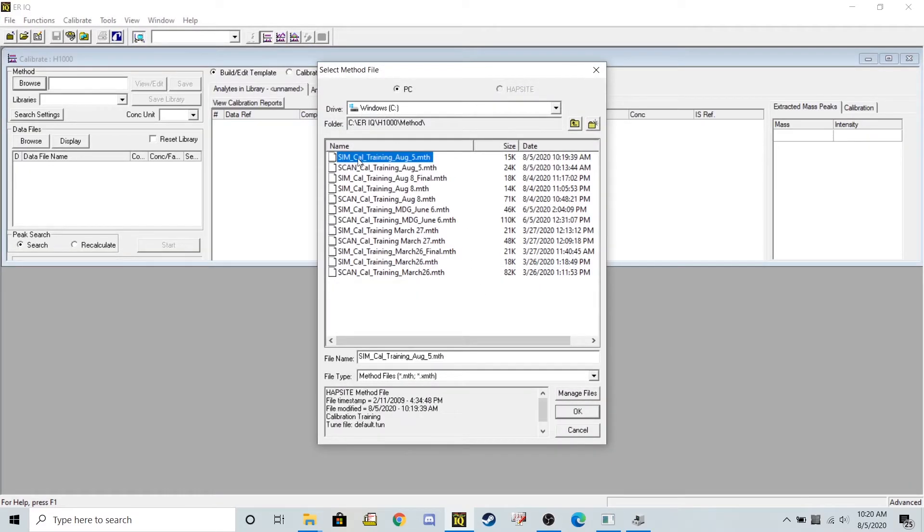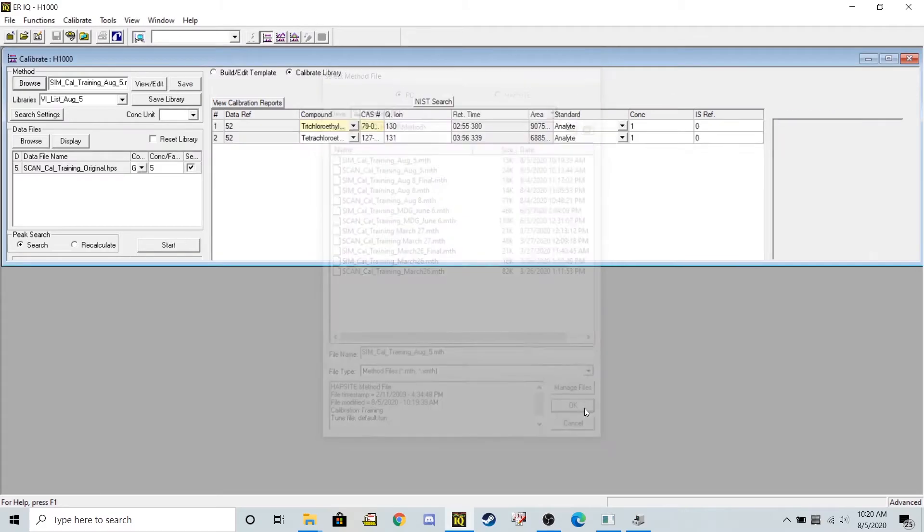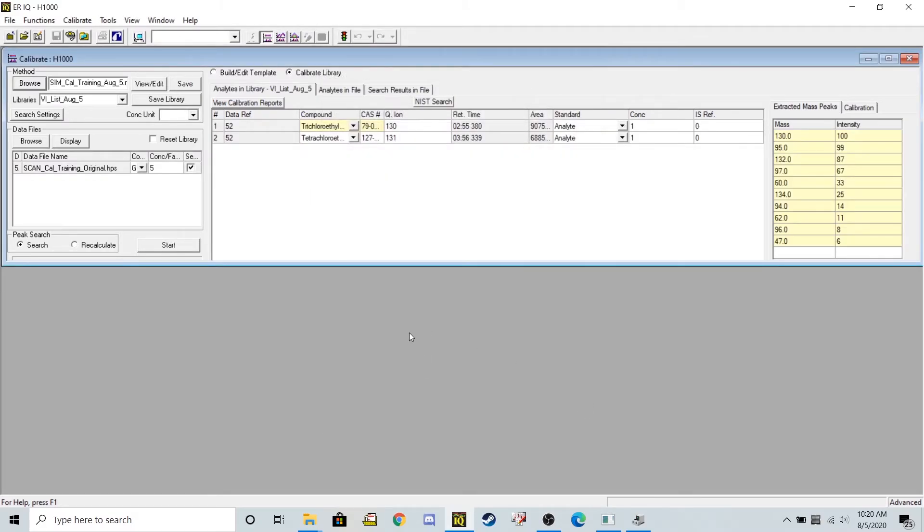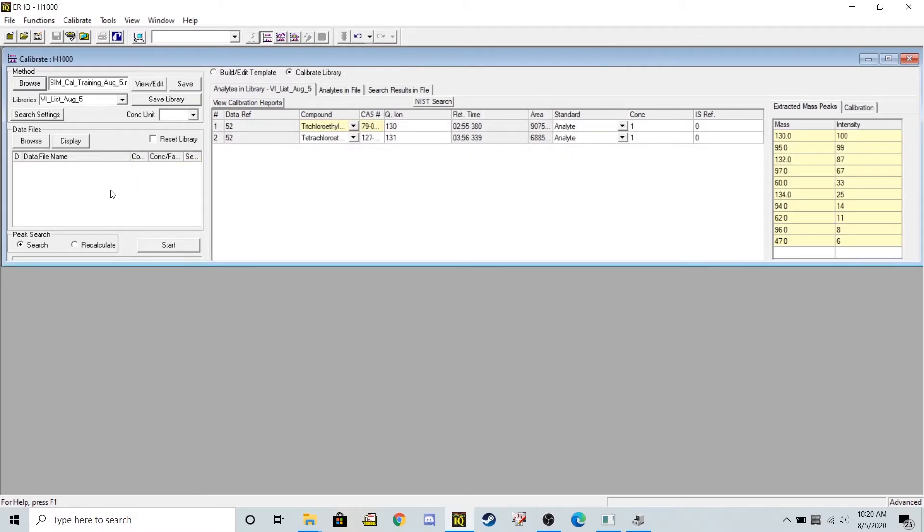Now we can load in our respective data files. So to do that, I'll hit browse on my data files, navigate all the way back to my desktop.